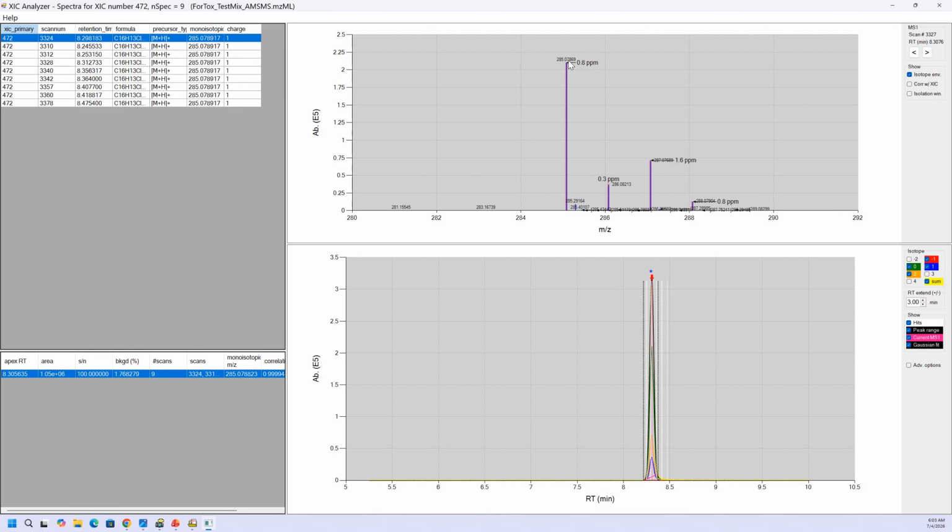And you can see what I showed you. Here's the isotopic cluster showing very good mass accuracy for the precursor ion, and also the theoretical pattern. You can see the two different colors, they essentially overlay. It's a very good fit to the generated isotopic pattern for that molecular formula. So this pretty much shows you the isotope. So if you want to see, this is an MS1 spectrum here. This isn't the MS2. It's not the fragmented spectrum like we saw on the other display, but it's the MS1.